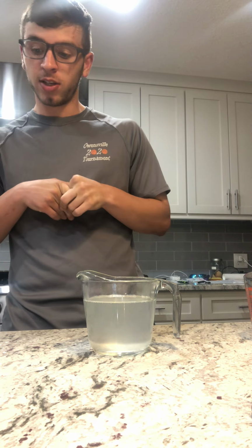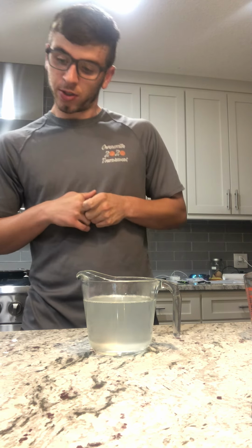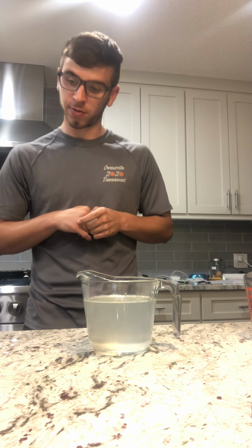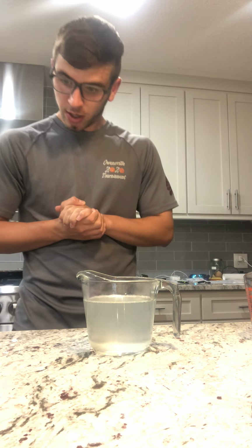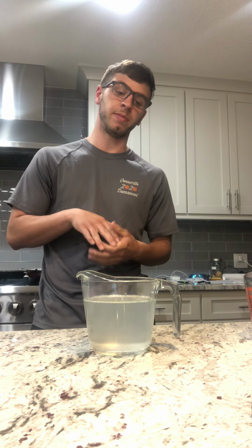The vitamin C in this reaction is going to be consumed because of an excess amount of hydrogen peroxide. So therefore, the I2 is going to accumulate since the peroxide is eliminating the ascorbic acid, which wants to bring it back to I-.